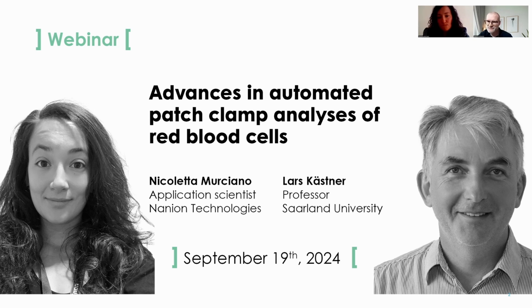Another question, always from Michael Netzer. What was the current density for Gardos channels in erythroblasts? Current density means normalization of current with the capacitance. So what I've shown is just absolute currents. They are not current density.